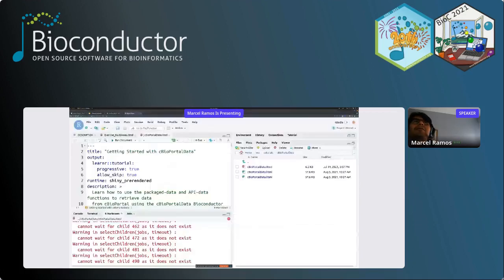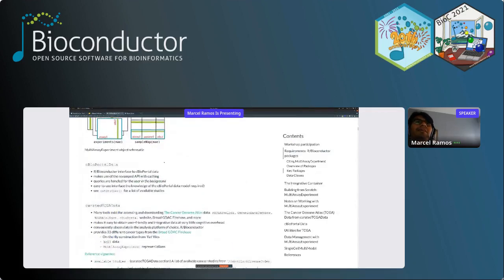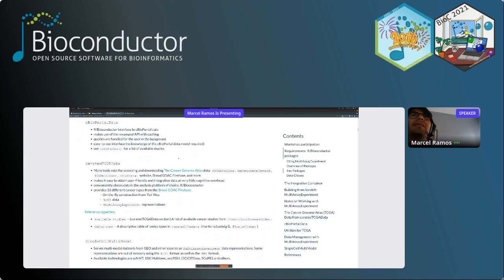And now we can go through the following packages here. So we'll look at curated TCGA data. This was part of a pipeline that we worked on to take data from the Broad GDAC Firehose pipeline and serve it as MultiAssayExperiments. So it makes use of a number of packages like RTCGAToolbox and TCGAutils to serve these data sets for you.